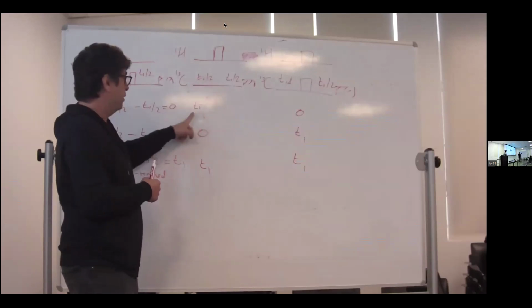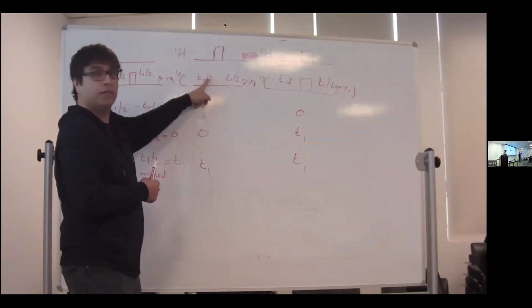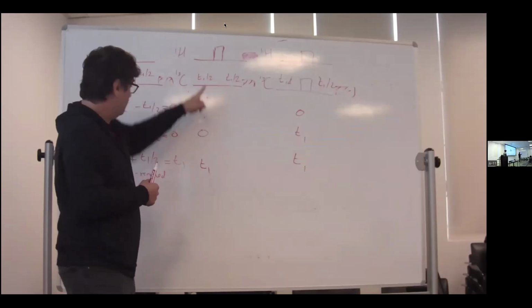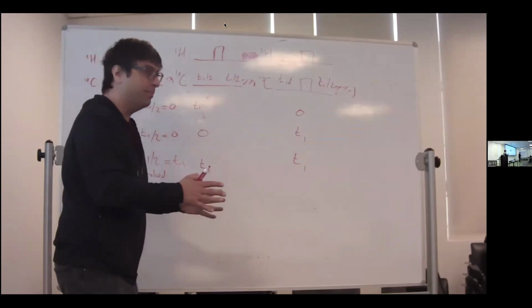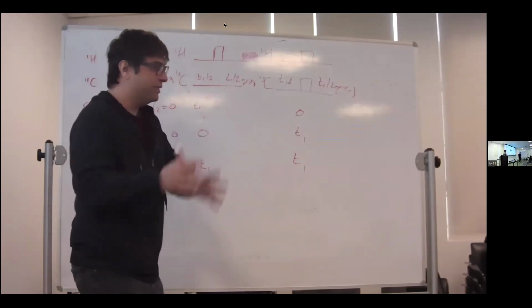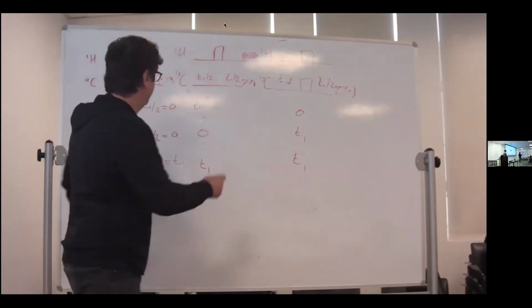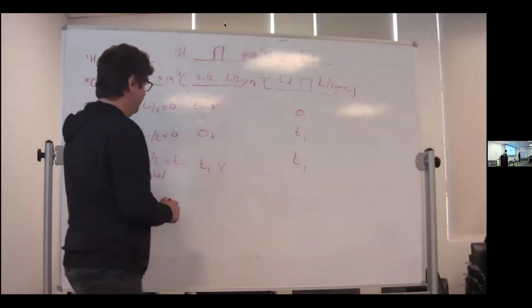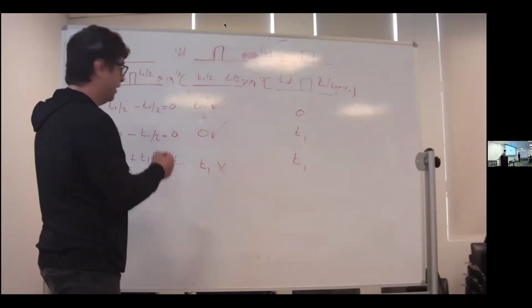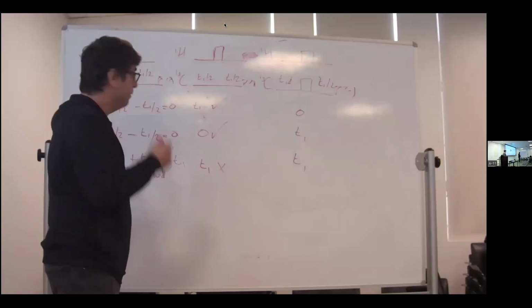Yes. So what are you going to do to the middle? How would you change this pulse sequence to allow that? Because this one doesn't have any CH couplings. I want CH couplings, I do not want CC couplings, and I want chemical shifts. I want this, I want this, I do not want that. None of these accomplish that. Would it be the top of one and bottom of the other?